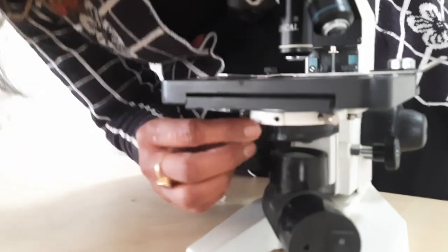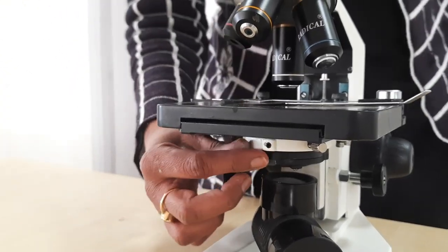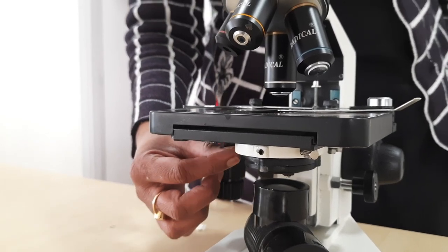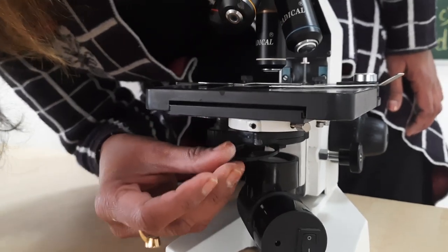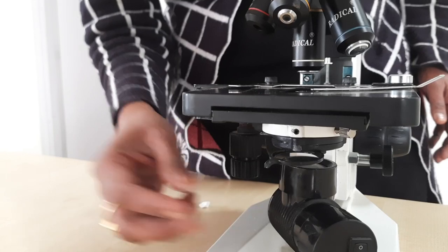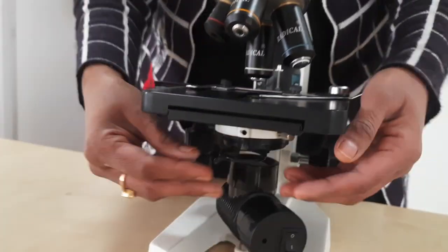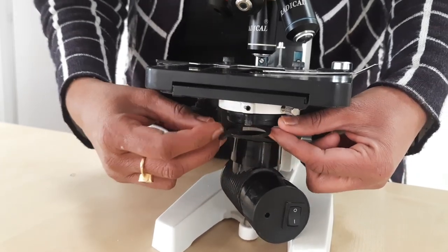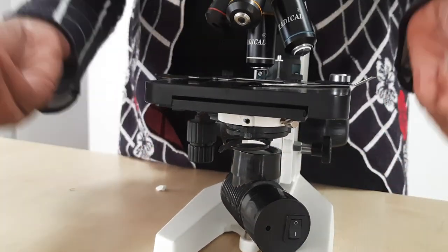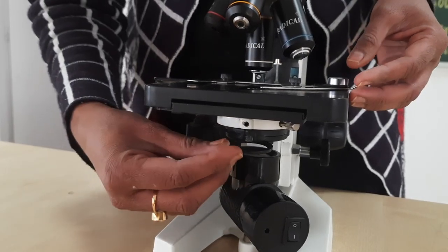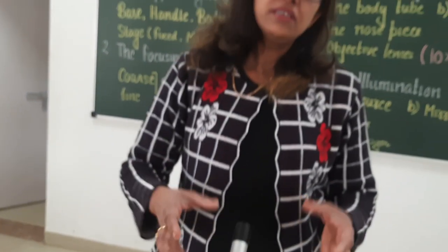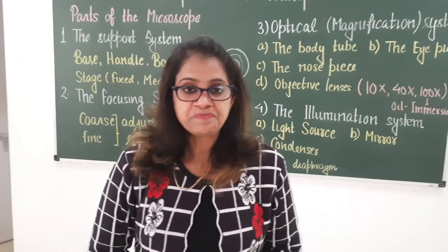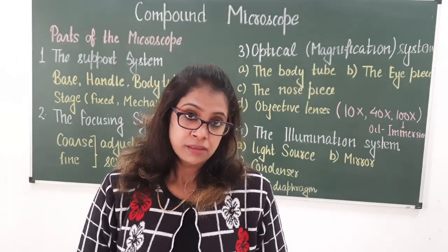The iris diaphragm is placed inside the condenser. There is a knob you can see by which you can control the iris aperture. There is also a circular frame used to place a colored sheet to control the wavelength of light. No colored sheet is placed here since white light is needed for these experiments.